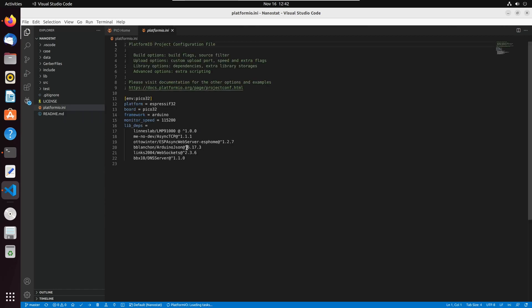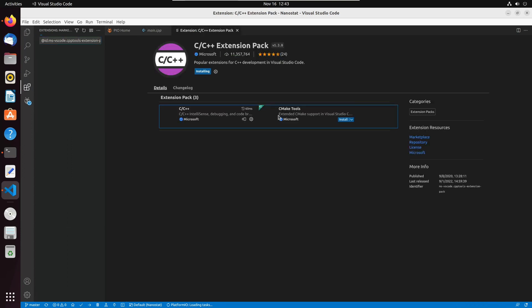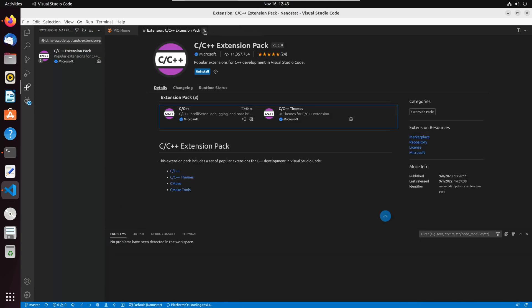Trust it and it'll import. The platformio.ini is the configuration file — it tells you which board you're using, which framework to use, what the baud rate is, and especially what libraries you need. These libraries are downloaded automatically from the internet. The LMP91000 library from the Linnes Lab is a very important one for the analog front end, and the other libraries are for Wi-Fi. It's all pre-configured — you don't have to install any more libraries.